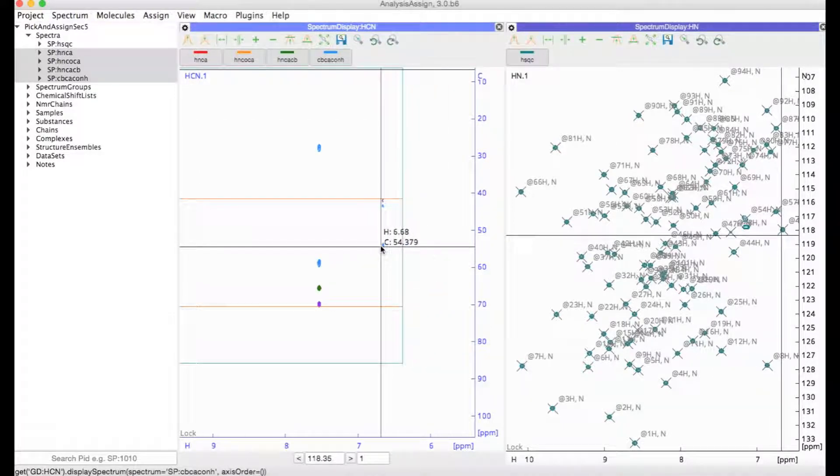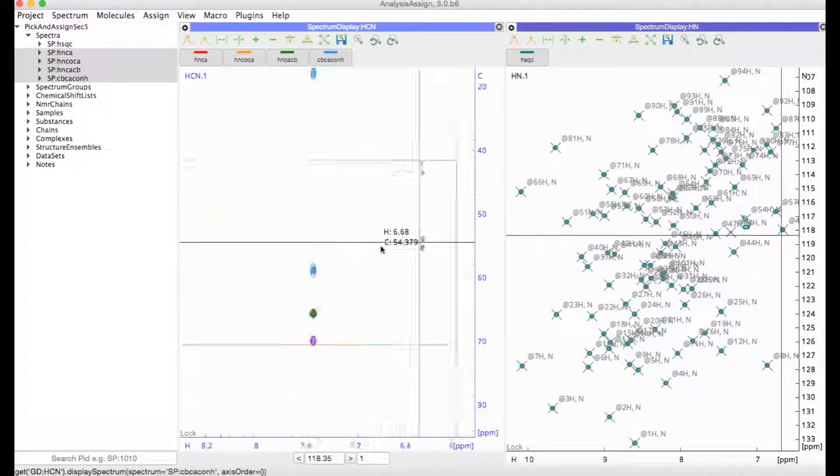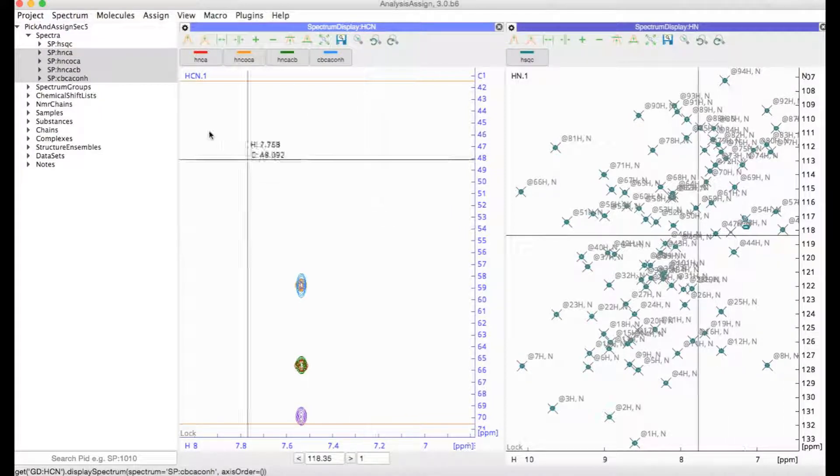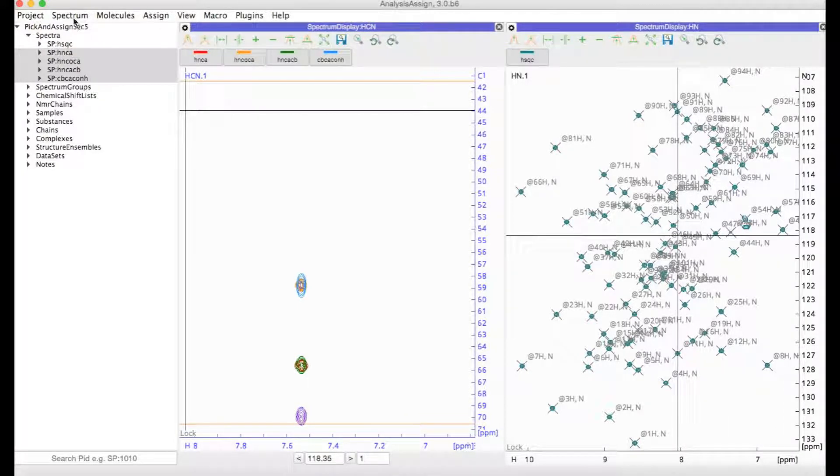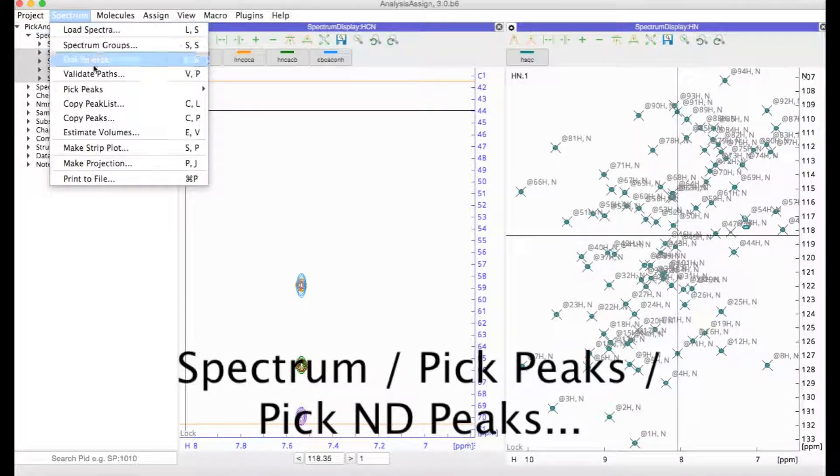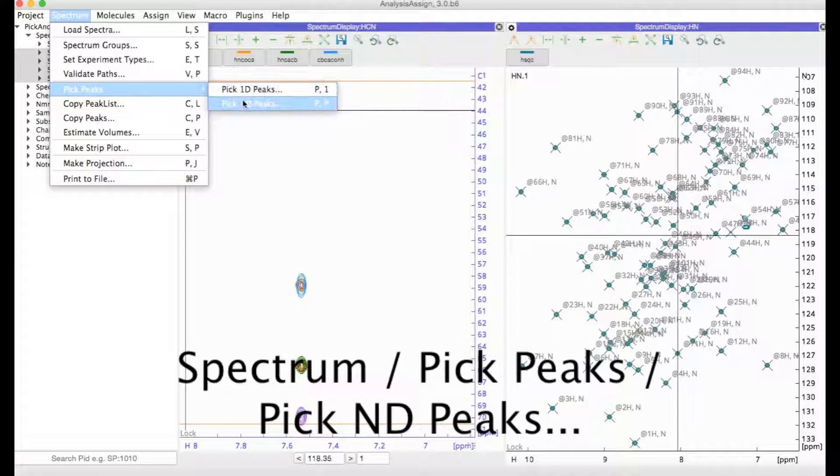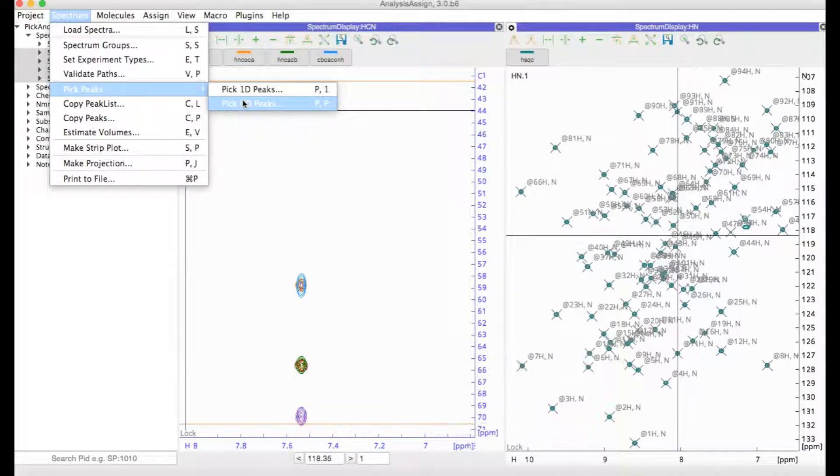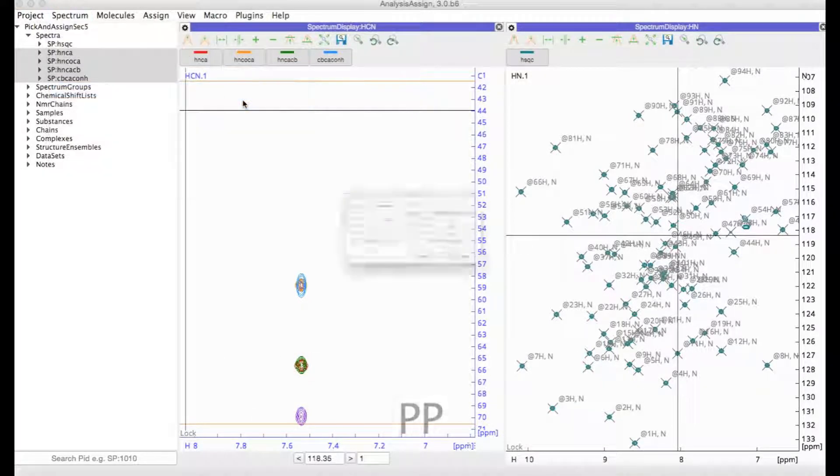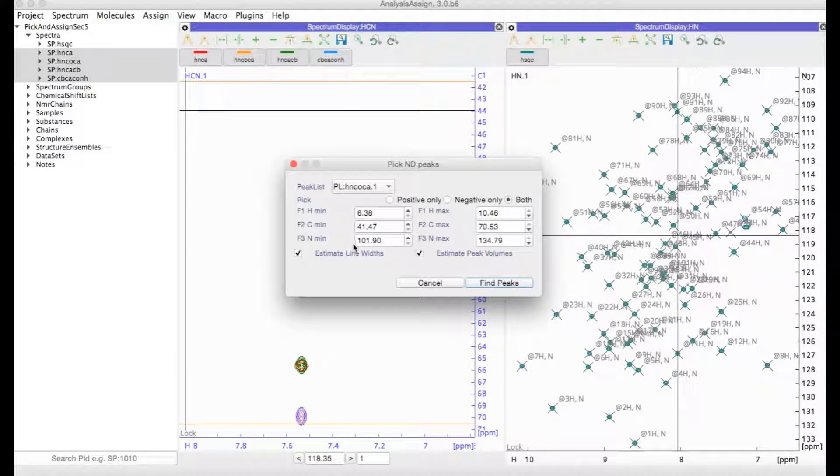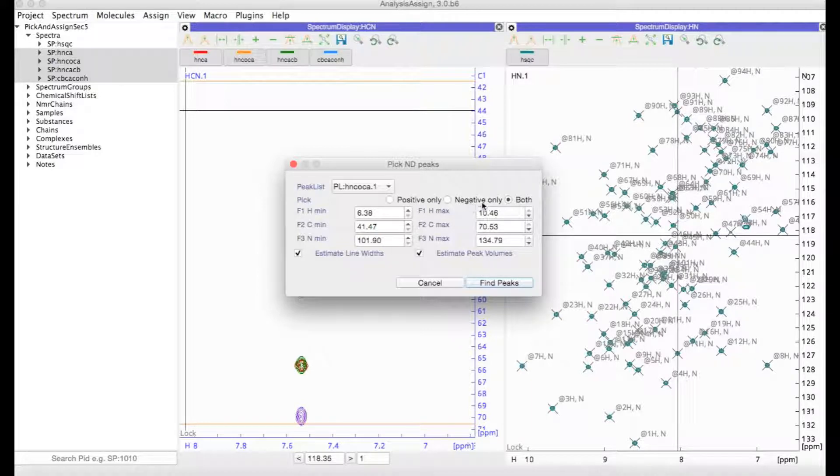Now, there are several ways in which you could pick your 3D spectra. One would be to go to Spectrum, Pick Peaks and Pick ND Peaks, or you could type PP for short. This would allow you to select a peak list and then an area in which you want to pick peaks, either positive peaks, negative, or both.